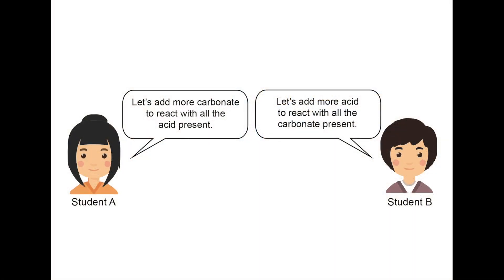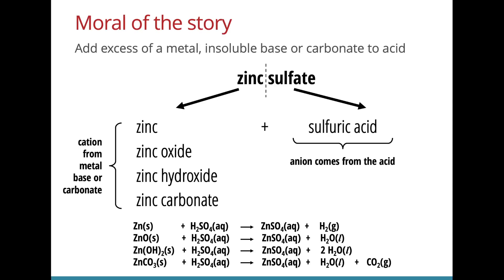So we have a dialogue between two students here. One says that we should add an excess of a carbonate to react with all the acid present. While student B says we should add more acid to react with all the carbonate present. Who do you think is right? I would agree with student A because by adding an excess of the carbonate, the excess carbonate can be filtered off and removed. However, if we follow what student B does, the excess acid is difficult to remove and you will contaminate the salt that we are forming. When it comes to this matter of salt preparation, the moral of the story is to add an excess of a metal, base or carbonate to an acid and then filter off the excess. This is to ensure we do not be left with an excess of acid which is difficult to remove later on.